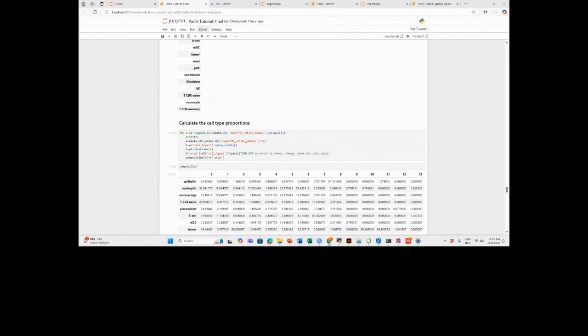It can also be that they are separated because of the spatial distance, like they're just located on 2 different sides of the slide, but they may be very similar to each other. So it depends on what you want to do. If you don't really need to go into detail in the macrophage clusters, you don't have to separate them. You can just put macrophages. So it depends on your analysis and what you want to do. Okay. Thank you. You're welcome.